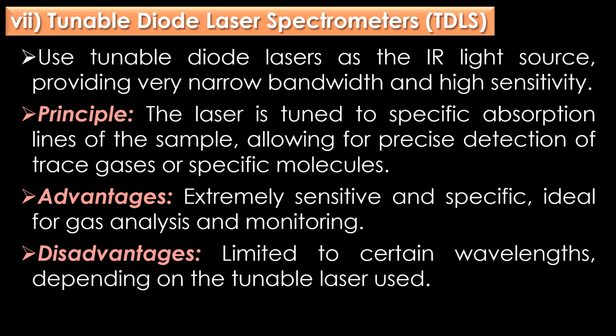or specific molecules. Advantages: this TDLS technique is extremely sensitive and specific, ideal for gas analysis and monitoring. Disadvantages: the tunable diode laser spectrometers are limited to certain wavelengths depending on the tunable laser which is used.